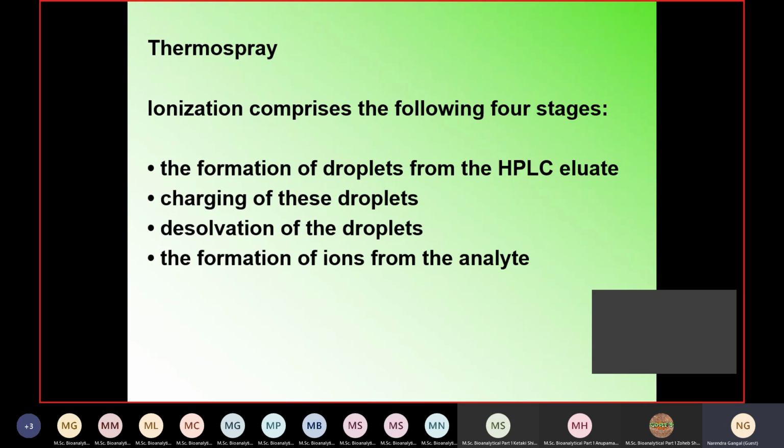In addition to that, you can use many other things like buffers. There are buffers which are used typically in HPLC. Why are buffers required? Because again, I do not want to discuss a lot on HPLC because you know HPLC very well. Buffers are used in order to have proper separations and shapes of the peaks. Without the buffers, some of the materials which are acidic or basic will not show a proper shape and separation. That is why buffers are used.